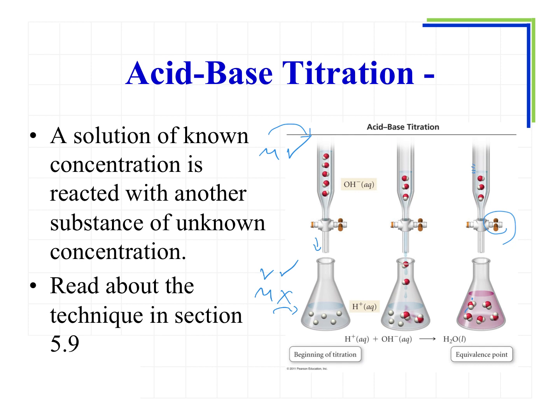The burette is graduated, so you can read the start line. When you want to start, you can see the volume, and then when you stop, you see the difference, so you know how much volume of the solution in the burette you used up. So you know the molarity and the volume.